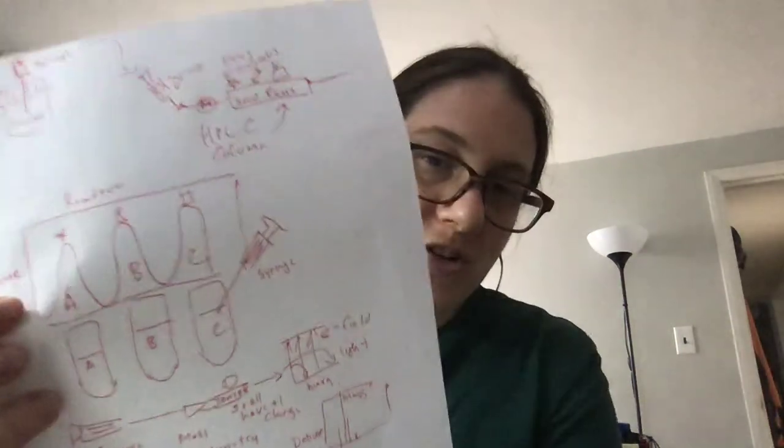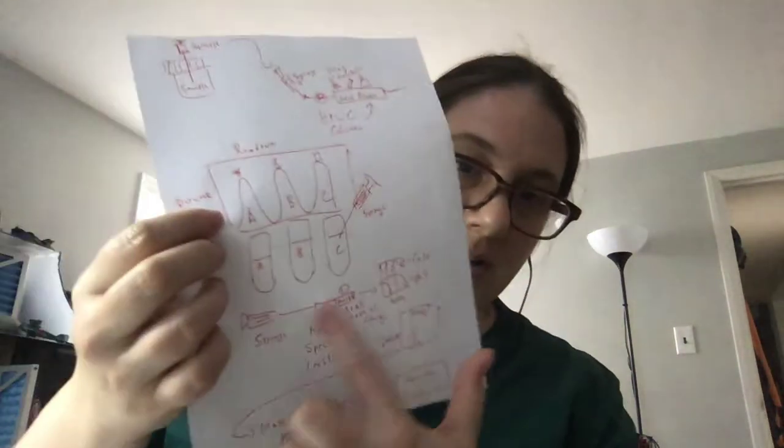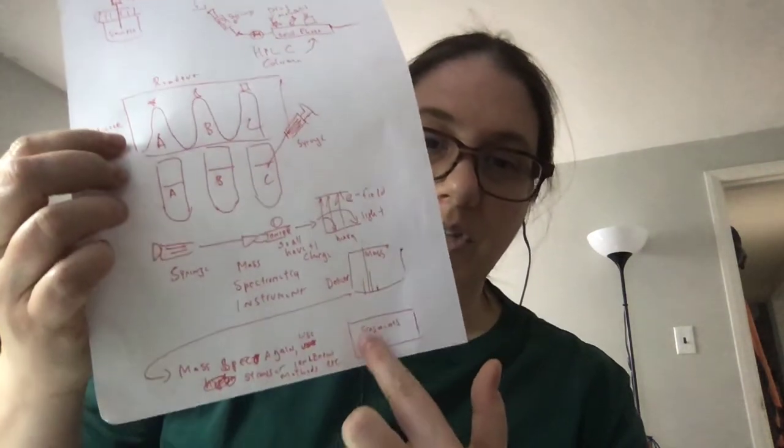And so that is how they do that. They'll do that again and again, because you can imagine they're going to have a lot of different peaks here. And so they have databases of this information that they can cross-reference with. And we can access this too as academic scientists. And so that's how that is done.